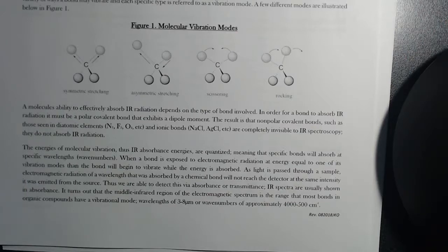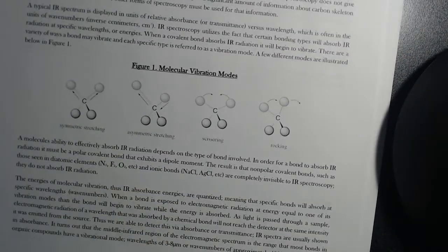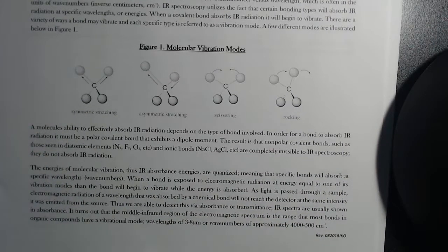We're going to see that there's an aldehyde stretch here. You actually get two signals from that one H atom, and it has to do with how it's stretching, not necessarily how many there are. So try to avoid correlating the number of signals for a given type of compound with how many bonds to H there are. I see students do that all the time.